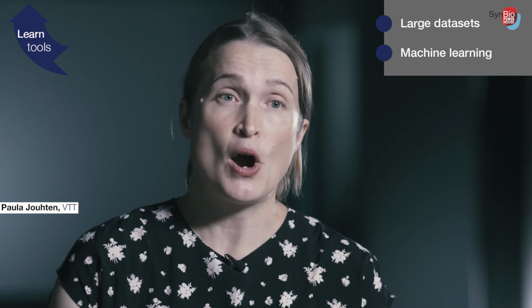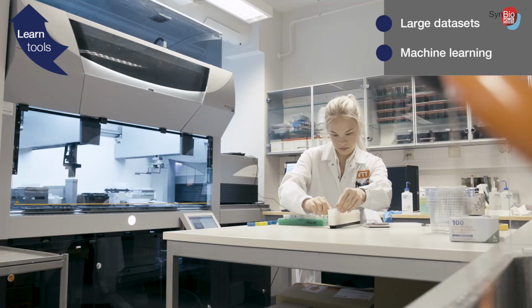So if we can combine, maybe even this kind of human guided machine learning, where sometimes the scientist can interfere and take part in the learning cycle, the machine learning algorithms will enable us to do this faster, and this will be of course supported by the automated means for engineering cells.